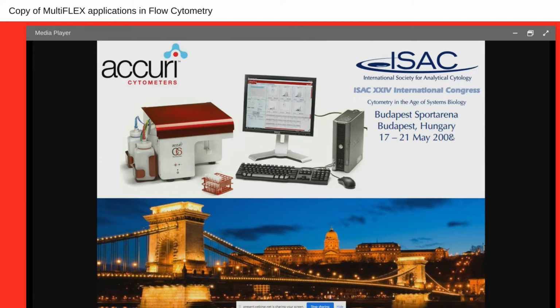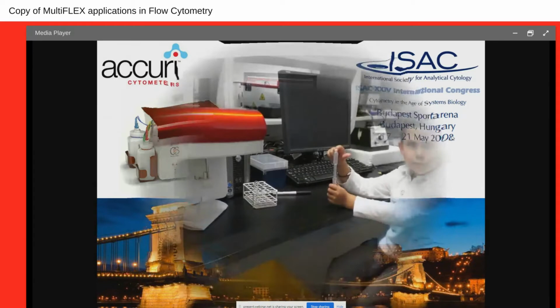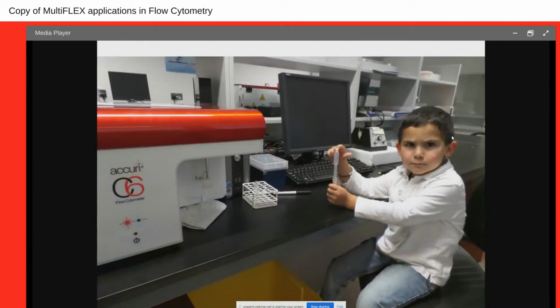It was a very different instrument because it was very small, very compact. There were no big tanks of fluidics. It was kind of weird to see that kind of flow cytometer, and they were promising that it was a flow cytometer. They also had something different in the electronics, which was the way the photomultipliers were located. They have 7 log decades. So all of that was kind of weird. But at the end of the day, it was a very easy to use flow cytometer.